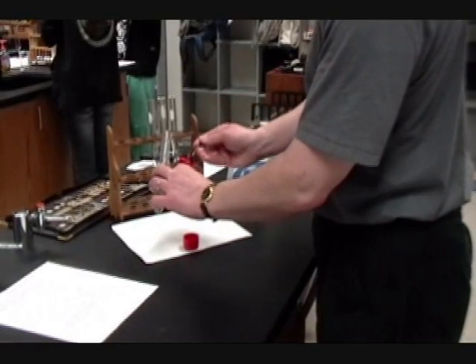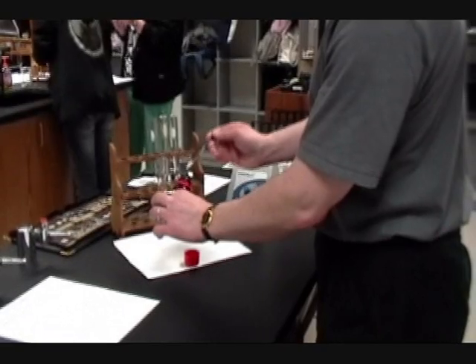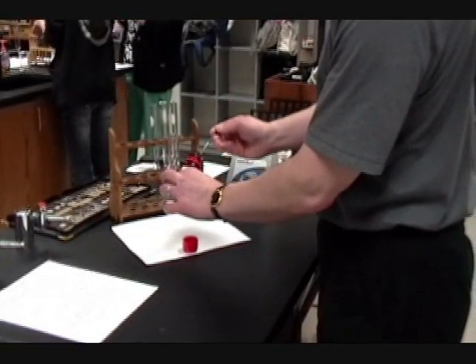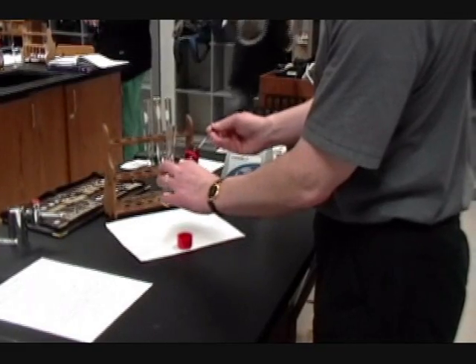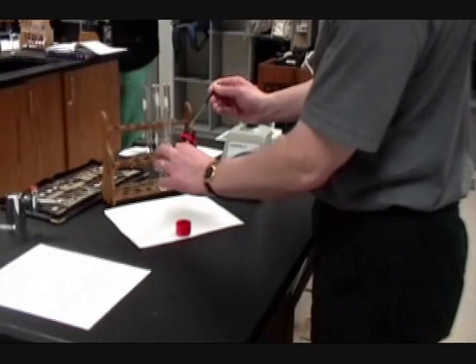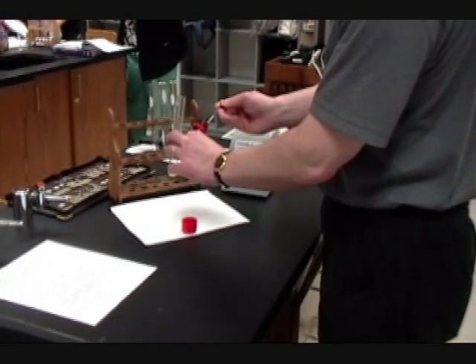Now, to start the experiment, you're going to have to get your solution saturated. Get it saturated with ammonium chloride. So over the bench, you're going to keep adding ammonium chloride until no more can dissolve. So you're going to use the device on the front bench to dissolve the ammonium chloride more quickly.